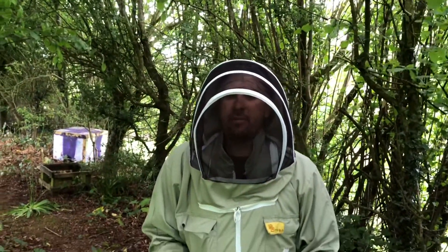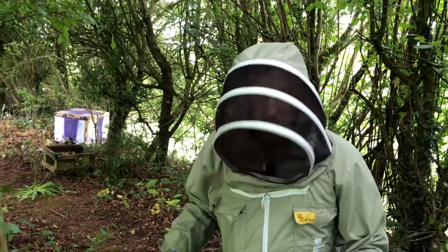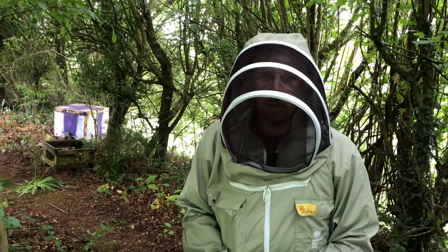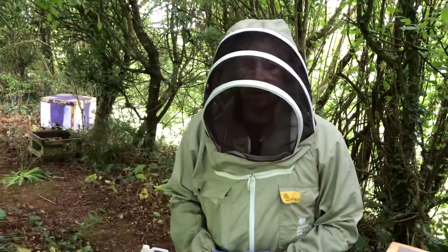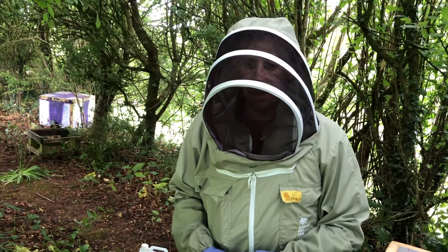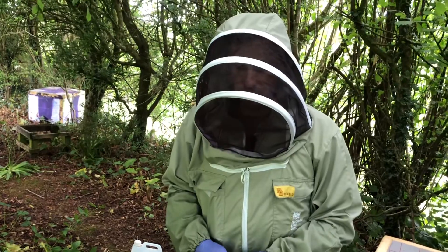I'm looking for a good representative sample from the hive, so I'm going to aim for a brood or pollen frame. On that frame I want to find a broad range of ages, including young bees and older bees, so I get a good sample covering all castes across the colony.